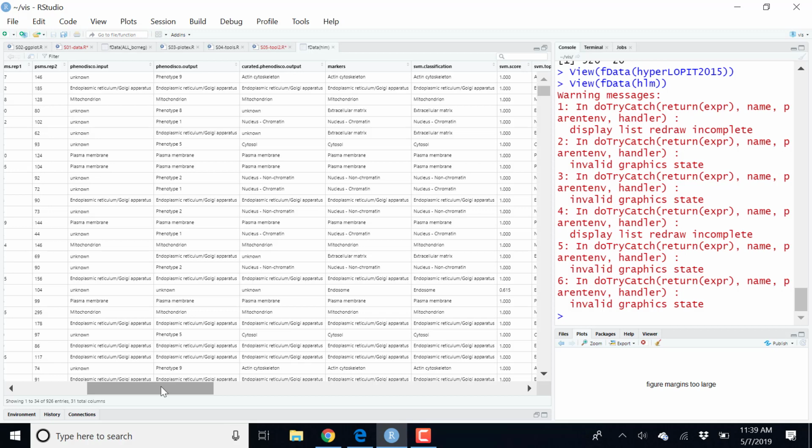an average measurement of all the proteins that are in the black class, an average measurement of all the proteins that are in the white class, and an average profile of all those that are in the striped class and in the dotted class. Instead of having a very complex tree with kind of 1,000 proteins, we want to summarize the protein intensities based on the classes that we have defined here. And we would do exactly the same thing if we had annotation for samples, but then we would take averages by columns and not by rows. Okay?